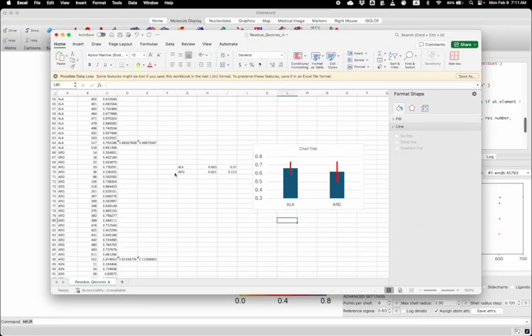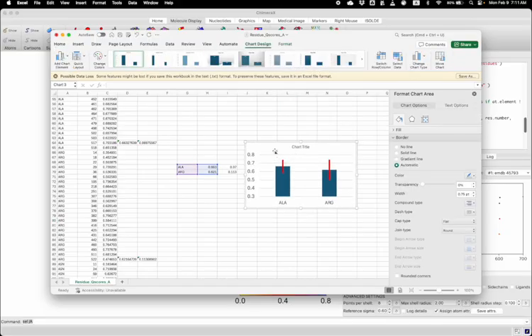We would like you to do this for all of the different types. There's only about 20. It can be done like this more manually or by scripting, perhaps with Python. And then we would like you to look at why they might have different averages and different variations in resolvability based on chemical properties. So if you can look up what different residue types are and what their properties are. For example, they might be more solvated, or they might be closer to solvent, or they might be more buried generally. And what are the variations in resolvability for these different types?